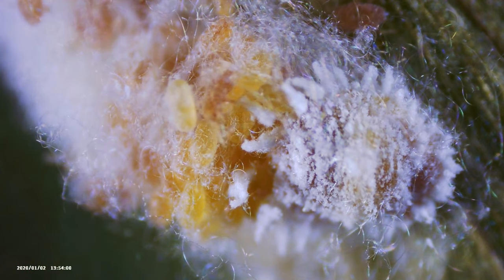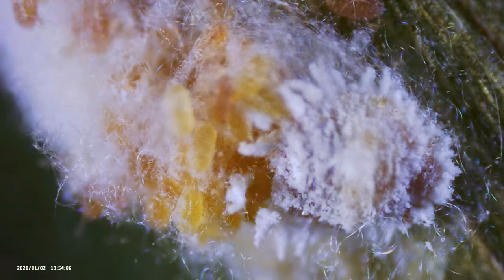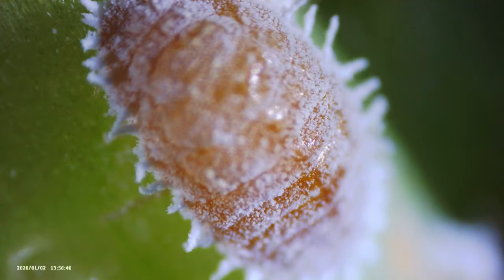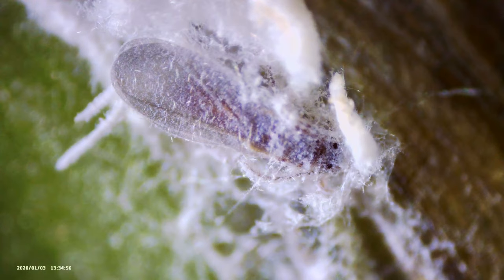I actually struggle with a lot of these pests because they're getting so good at hiding in little crevices — neem oil and even other treatments don't seem to work on them anymore. Some of these mealybugs you can even see how they're sucking the juices out of the plants, and then they excrete something called honeydew, which is basically a sugar that comes out after they process the plant juices. This stuff can cause mold or attract other pests. Until looking under this microscope I never realized they made little nests like this.